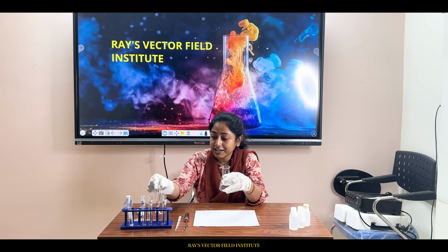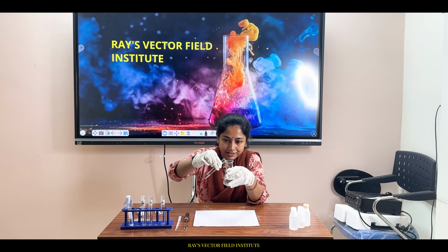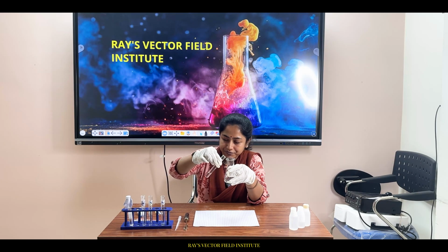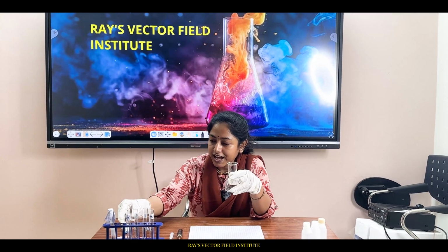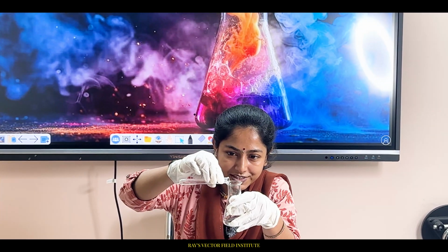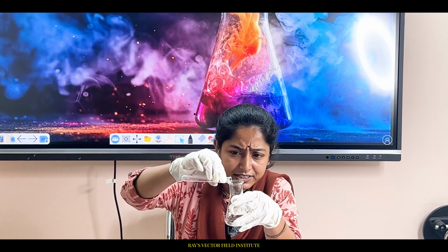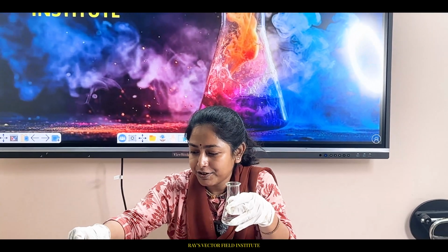Next, I am taking another liquid. Next, what I will be adding is this magic potion, a very little trace amount. Yes, I have added it.